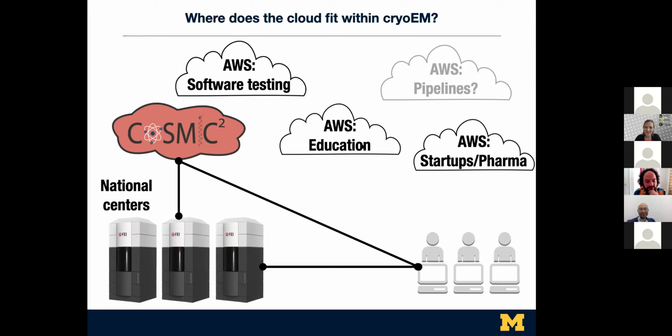There were also a couple of questions about the cost of transfer and storage of data. So going back to your math about the cost of this, Amazon costs, I guess. Yeah, exactly. I think people who are a little more savvy would know that on Amazon it's free to upload data and they charge you to download it. There's some rate to download it, and if you're academic, you probably have a reduced rate.